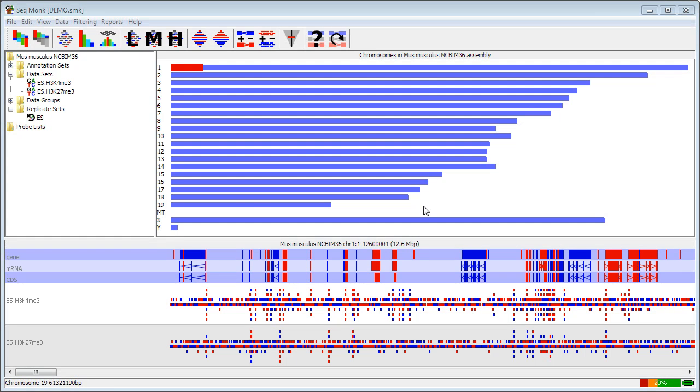Now that I've got a project set up with some data into it, I can start exploring the raw data inside my project. You can see from the main display that it's split into three parts.